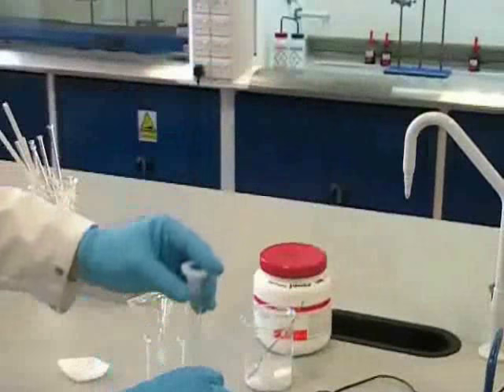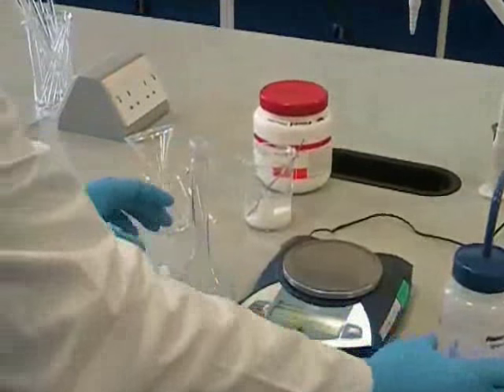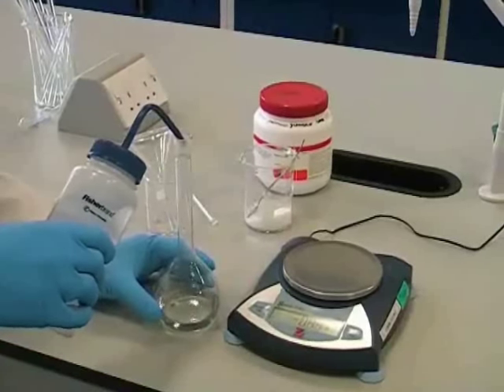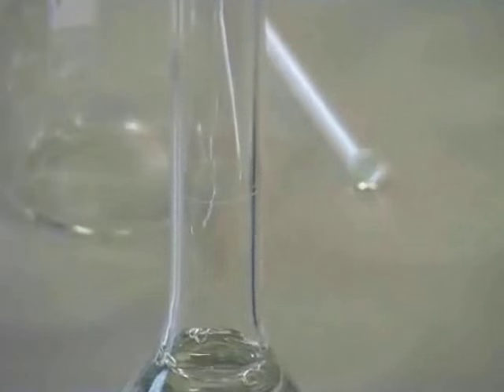And now we're ready to fill the flask up to the line. This can be done using distilled water from a wash bottle. As you get closer to the line, it's important to take great care because if you overshoot, you'll have to start the whole thing again.